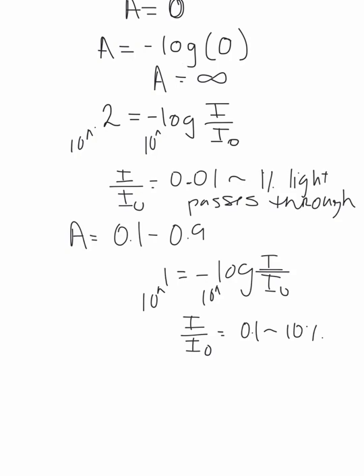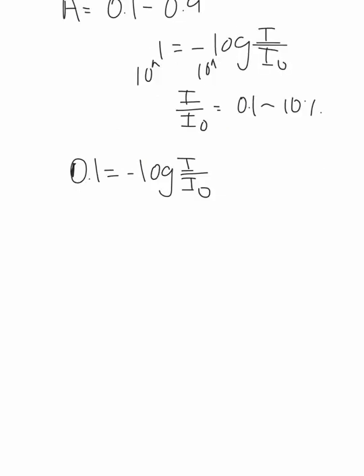An analytical chemist would have a better explanation for what an acceptable limit would be, but for the limits that I have always used in my research, between 0.1 and 0.9, here are the percentages of light that would hit the detector based on these absorbances. For a value of 0.1, we get a ratio of I to I naught of 0.79, or approximately 79%.